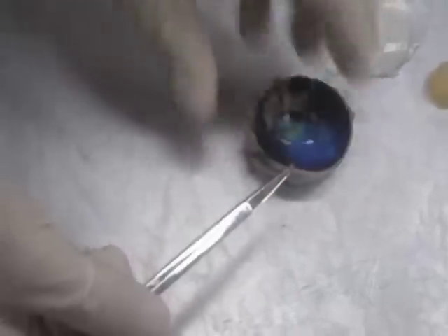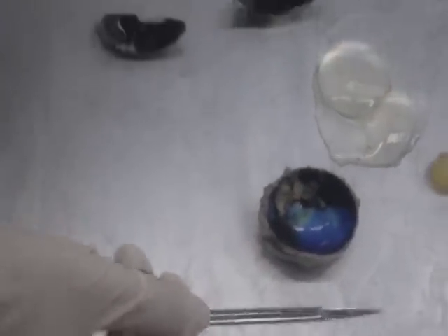Finally, encasing the whole eyeball is the sclera. Thank you very much. That's a cow eyeball.